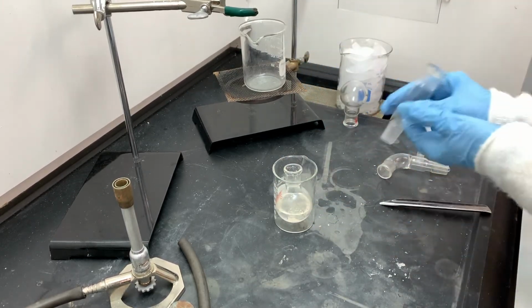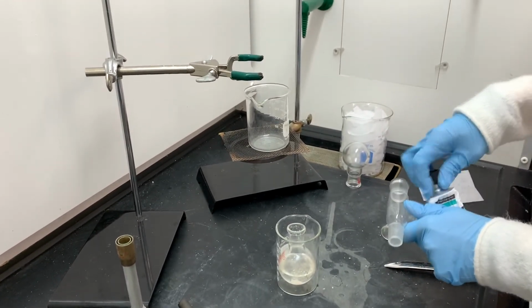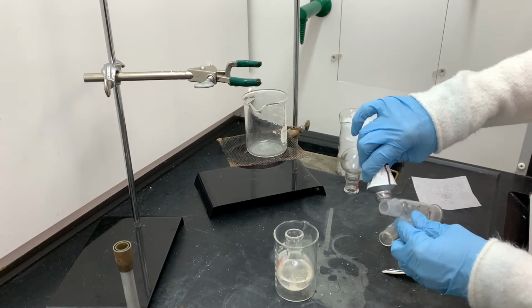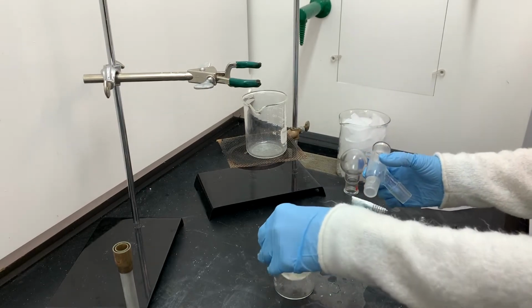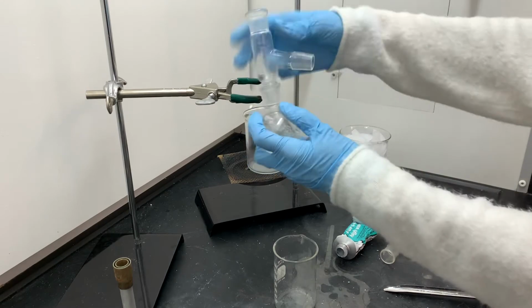So now I'm going to be assembling the glassware. This is an adapter. The adapter goes into the opening of the round bottom flask. It just allows, as the name implies, us to connect different pieces of glassware together. Sometimes a thermometer is placed inside these adapters. We won't be using a thermometer in this situation.